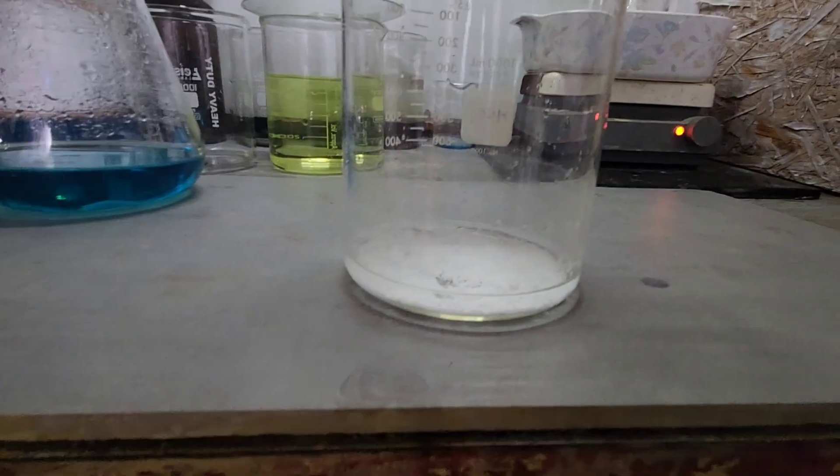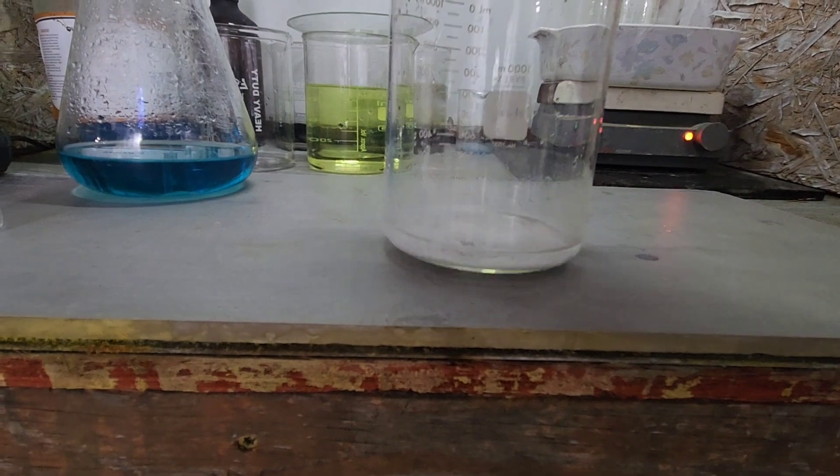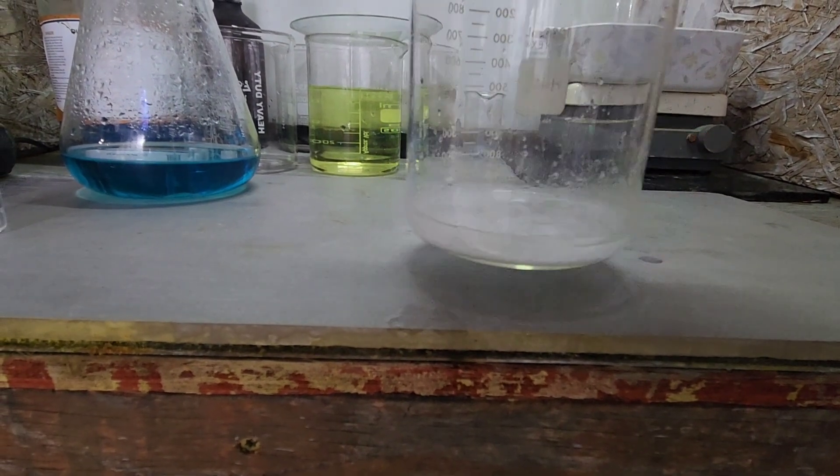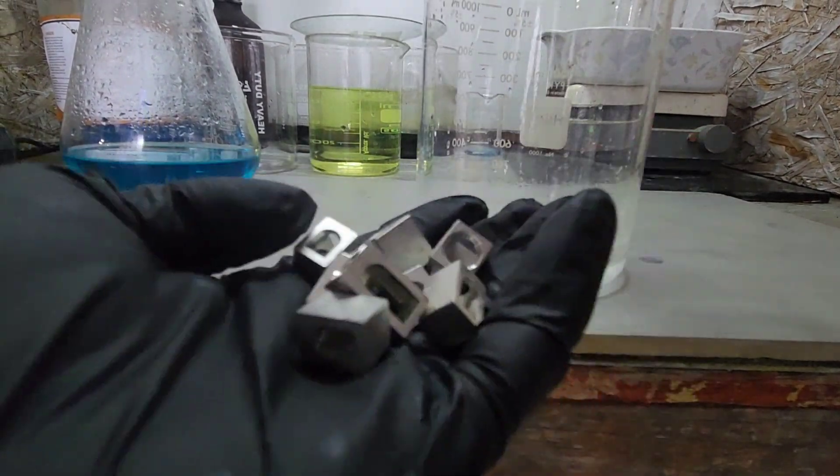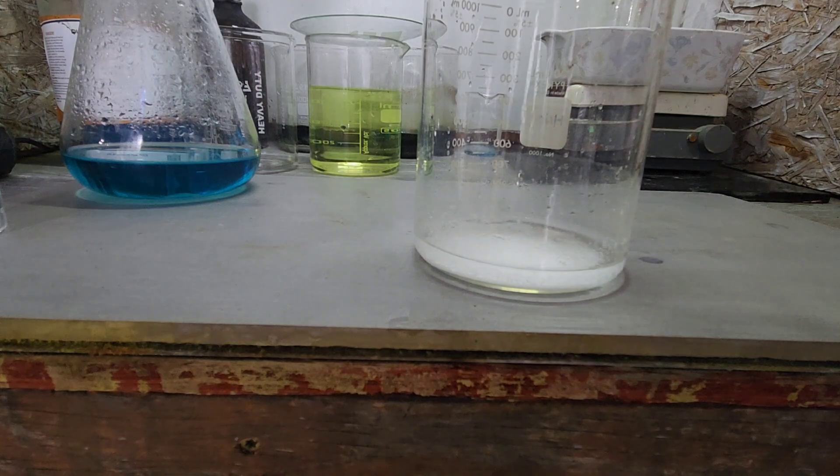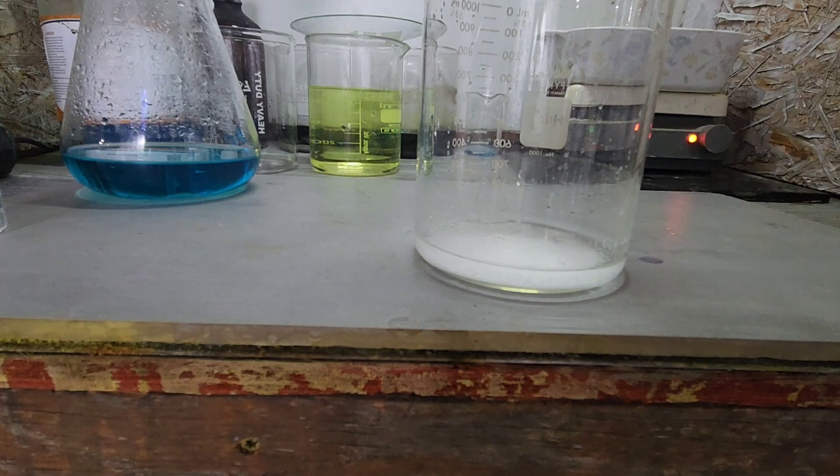Today we're going to attempt to convert this silver chloride back to metallic silver with a little bit of aluminum and some hydrochloric acid. Right now it's sitting in a little bit of distilled water.